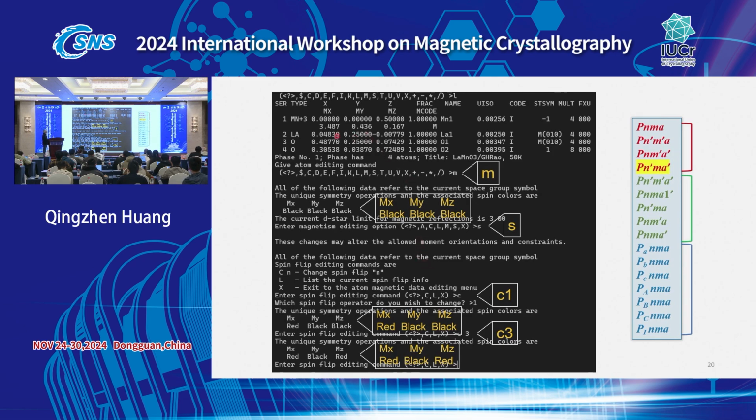Now we set the magnetic, in the latest atomic setting part. First you can see all the atoms here. You also need to define what the valence is, and in this case it's 3+.